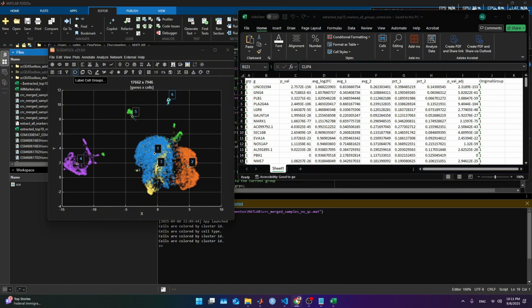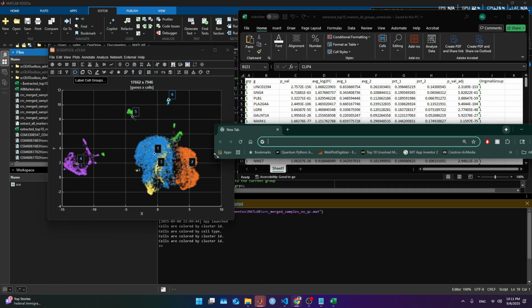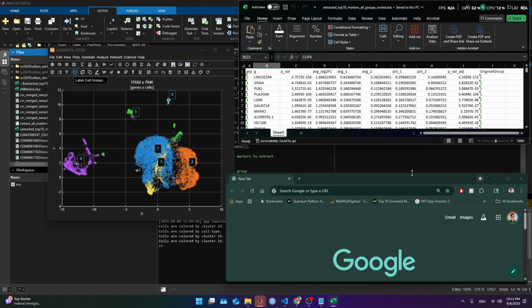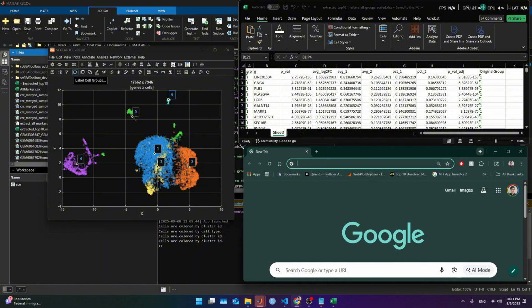We verified in a web page, and we worked with Enrichr previously, which is good. That's what we are still going to do to some extent.